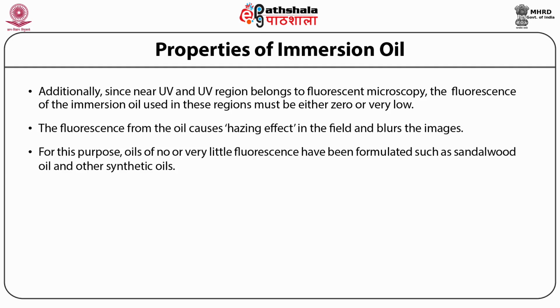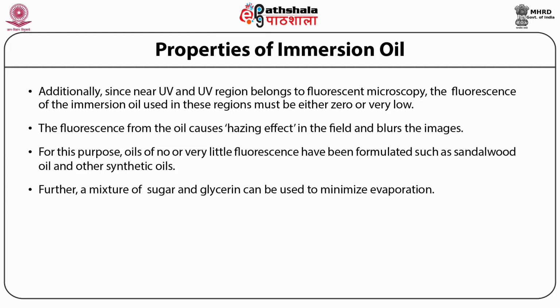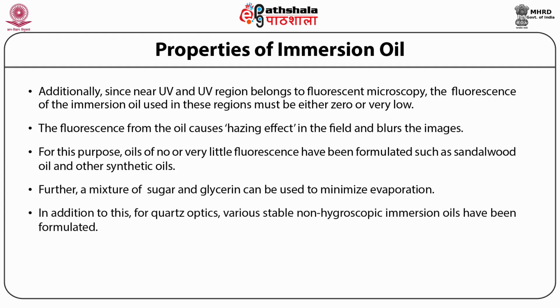A mixture of glycerin and water is often used in the quartz optics. Further, a mixture of sugar and glycerin can be used to minimize evaporation. In addition to this, for quartz optics, various stable non-hygroscopic immersion oils have been formulated.